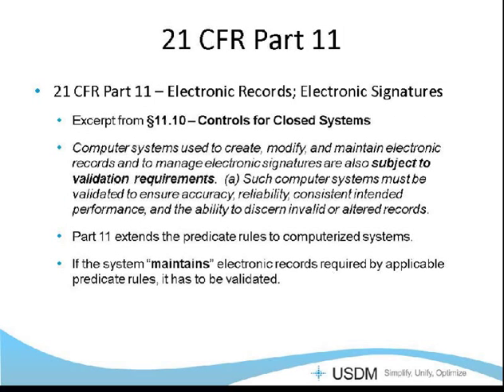I'm not going to go into a lot of the regulations in this discussion because I think most of you are fairly well aware of them. But 21 CFR Part 11: prior to the late 80s, prior to this act, people didn't use a lot of computer systems. They had paper-based systems. From the 80s forward, we've increased the use of computer systems in our laboratories every day.